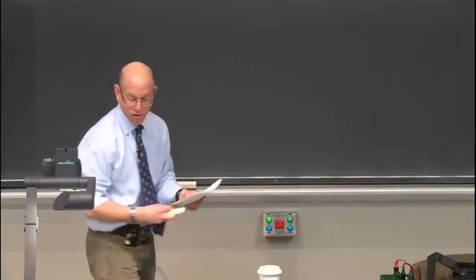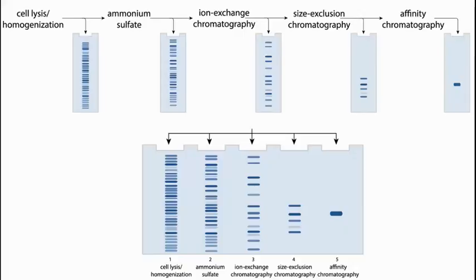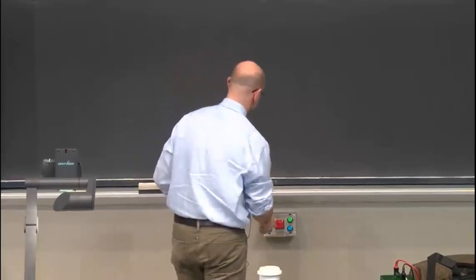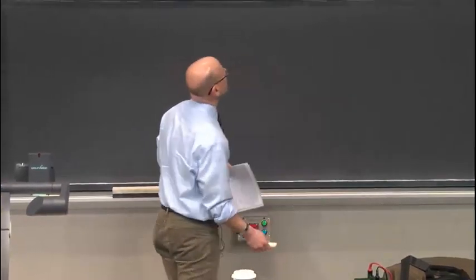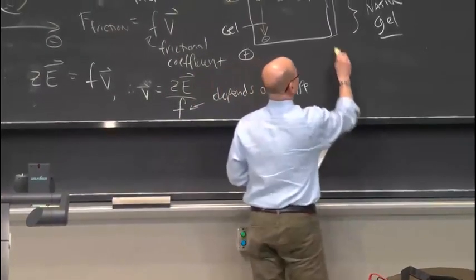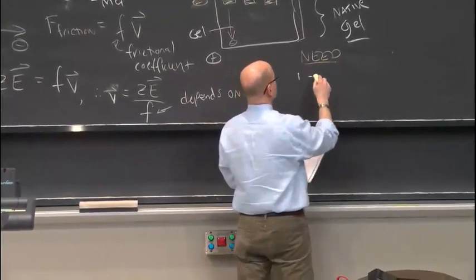We want to use electrophoresis to be able to see all the proteins. Remember I showed you that handout that had all the proteins. So we want to see all the proteins in our purification. So what we need, let me try to make better use of board space here. So what we need to visualize all the proteins in our purification is two things. We need, one, all the proteins to move in the same direction.